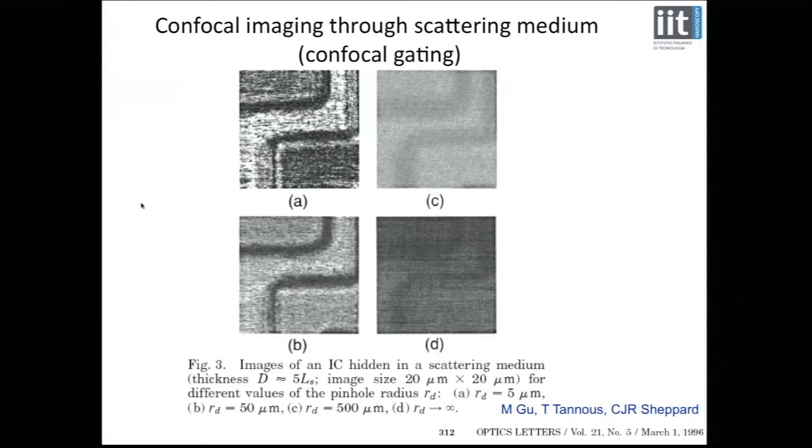This is now in my Australian days. I was at the University of Sydney in the physics department for 15 years. This was a paper that was published. Min Gu was my postdoc when I was in Sydney before he went off and did things on his own. This paper was about penetration into scattering media, showing how you get improved penetration into a scattering medium using the confocal effect. What you have to do is optimize the size of the pinhole and so on.